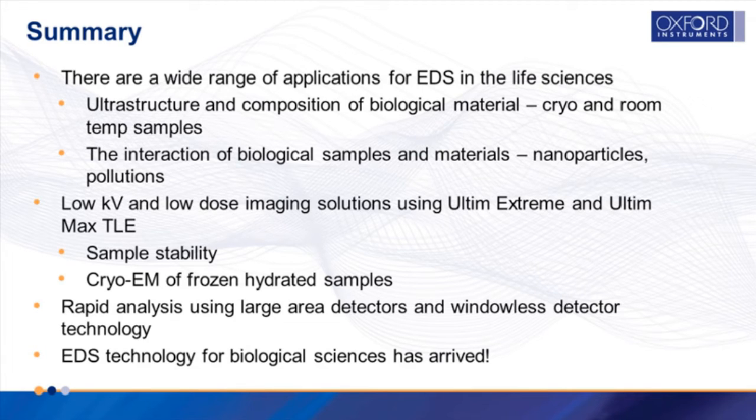We've also demonstrated some low kV and low dose imaging solutions and shown that not only can we achieve sample stability, but also cryo-EM and cryo-EDS of frozen hydrated samples. And we've been able to utilise large area detectors and windowless detector technology for the rapid analysis of our samples. So hopefully you've seen that EDS technology has advanced now to the extent where imaging biological samples is beneficial and also provides us unique biological information.